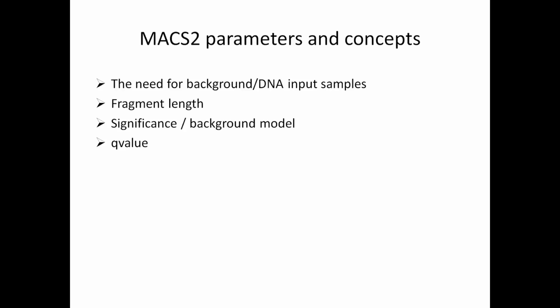So the FDR value, or now the qvalue, attempts to correct for this. By default the qvalue is set at 0.01 and is used as the significance threshold for reporting binding regions. A slightly more lenient 0.05 value is suggested for more diffuse binding regions such as histone marks.